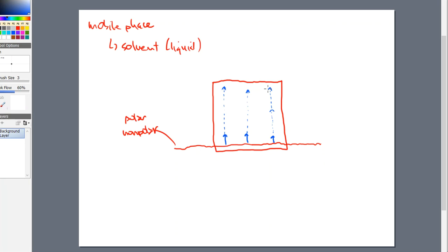All right? It's all based on the size of my plate, how much mobile phase has to be sucked up, and so forth. The bigger the plate, the longer typically you have to keep it in there because it's taller and it's going to take longer to suck that mobile phase up through the height of that plate. So you get my drift. If you want to be in the lab for 3 or 4 hours, choose huge, huge plates. But if you just want 30 minutes or so, choose little ones.